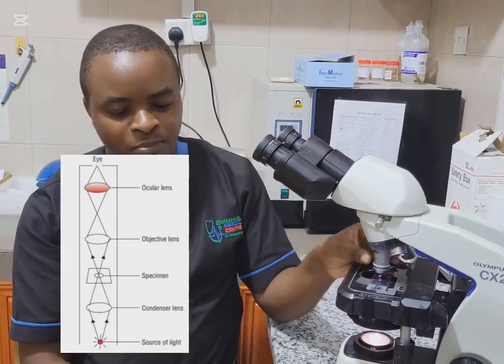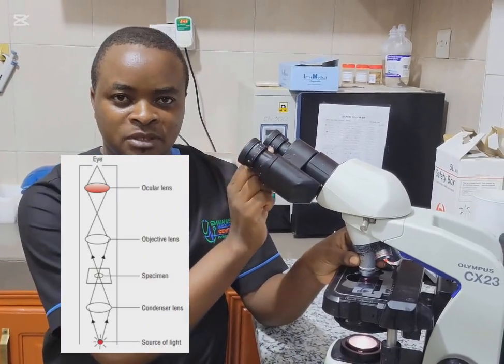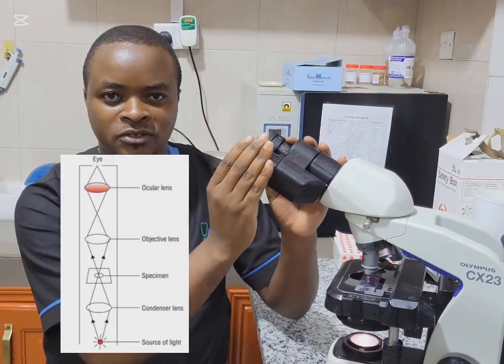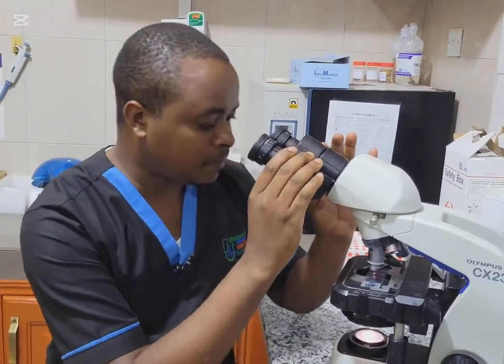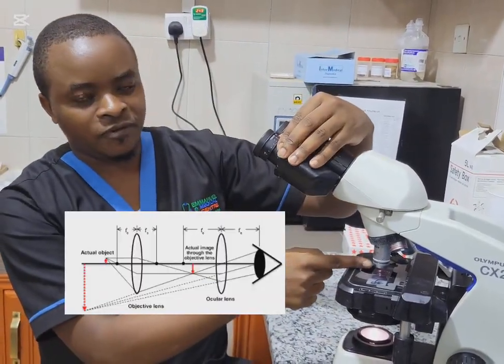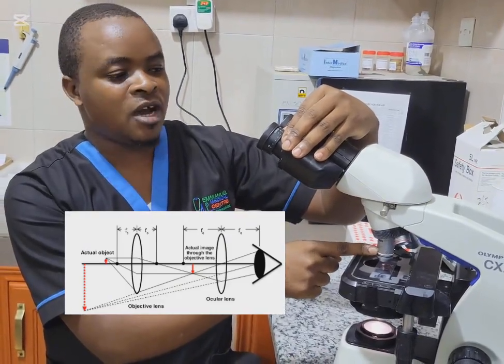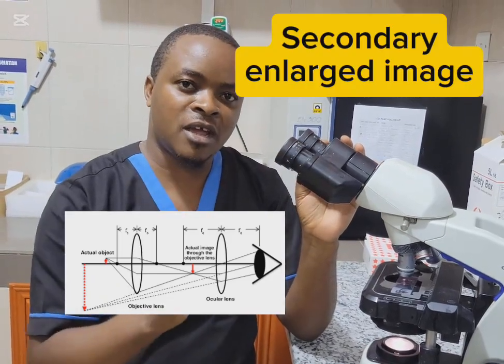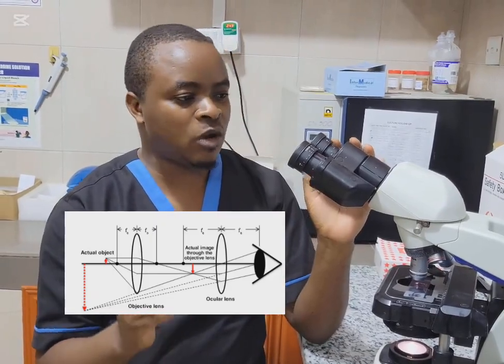So after forming the primary image, we have other lenses in the eyepiece. These are the eyepieces, which contain a lens. So this lens in the eyepiece, which is near your eyes, is going to receive the primary image, which is enlarged from the objective, and is further enlarged by the eyepiece lens to secondary enlarged image. That is what we can say.